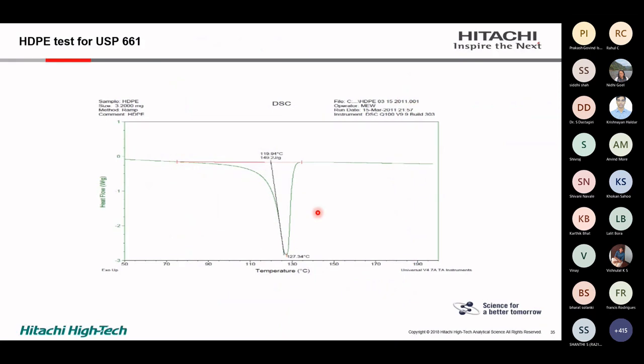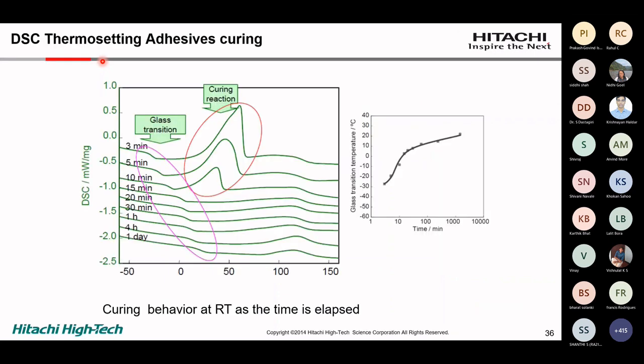People who are in the pharmaceutical industry are exporting their drugs or pharmaceutical products. If you go to the USA, the tablets are never sold in aluminum strips. The tablets are always sold in a small HDPE bottle. So for them, the question is whether the bottles coming from India are of correct quality or not. There is one USP method, which is called USP 661, and on the basis of USP 661, you have to quickly say whether the material is the same or not.